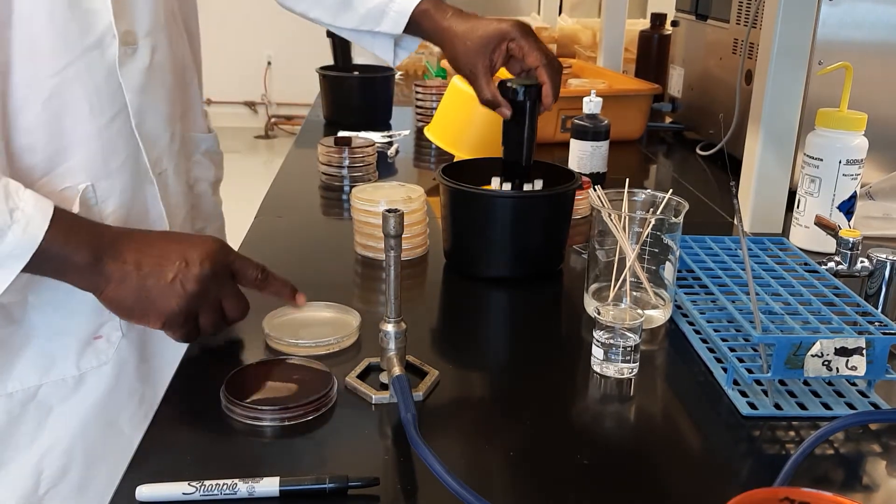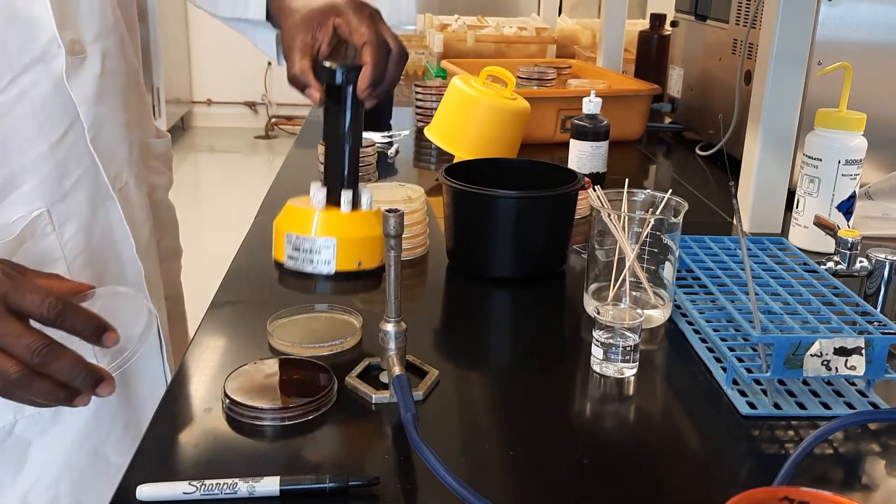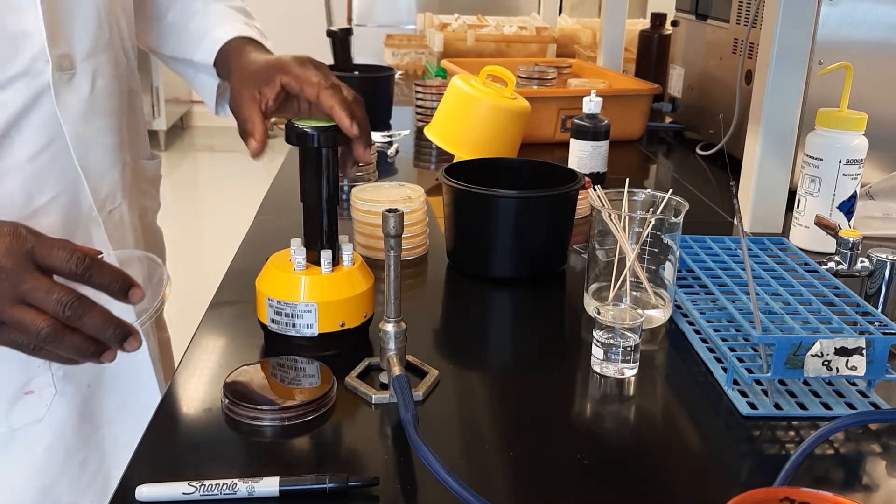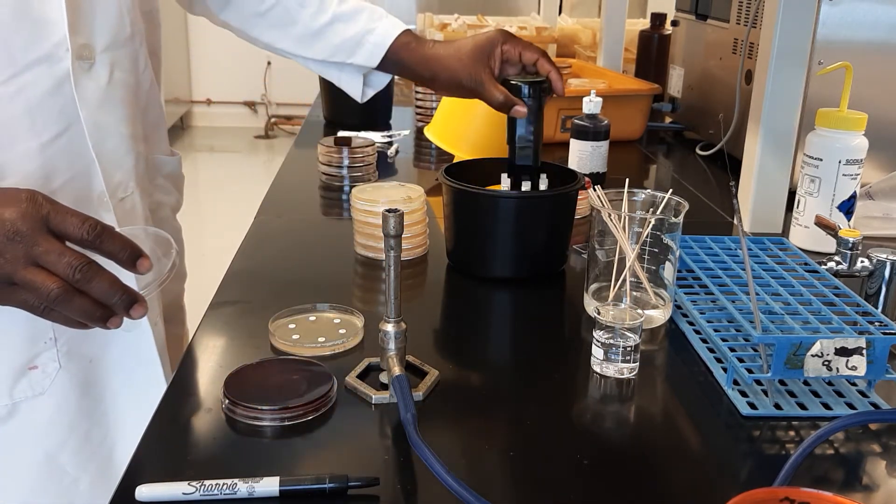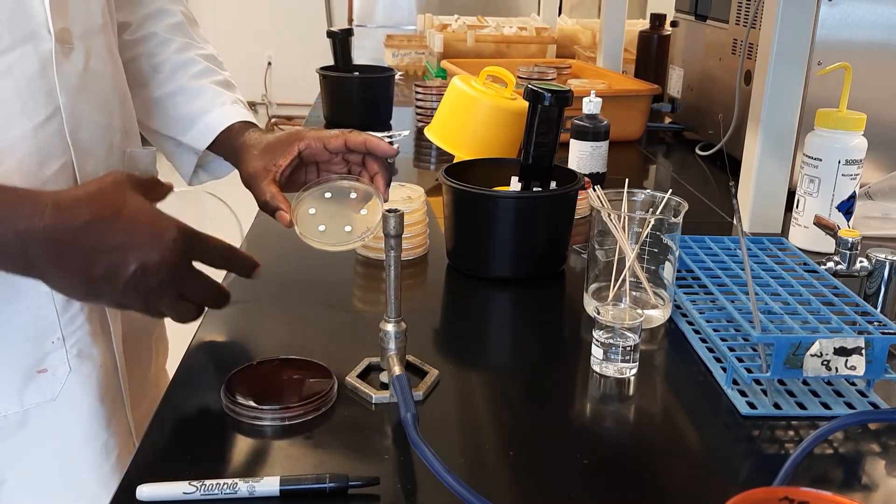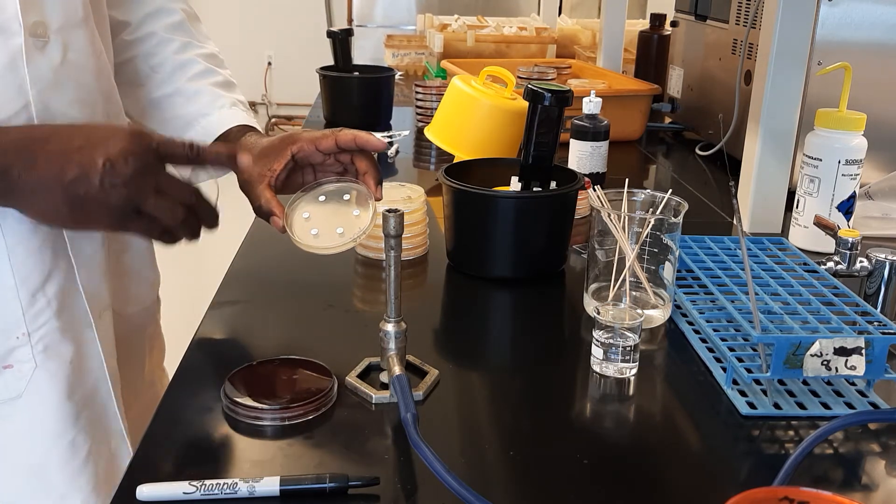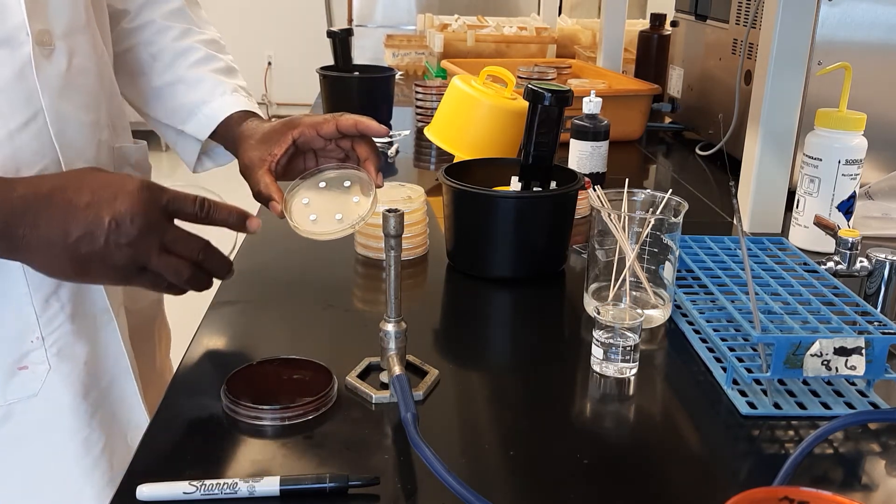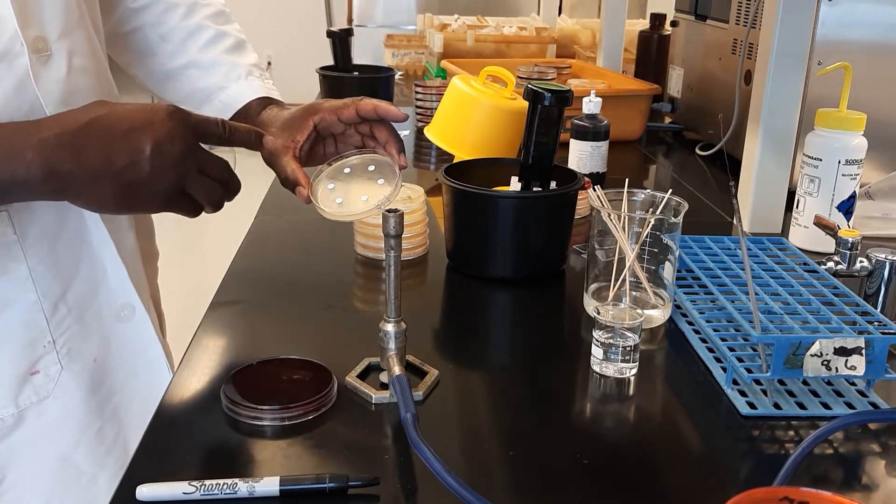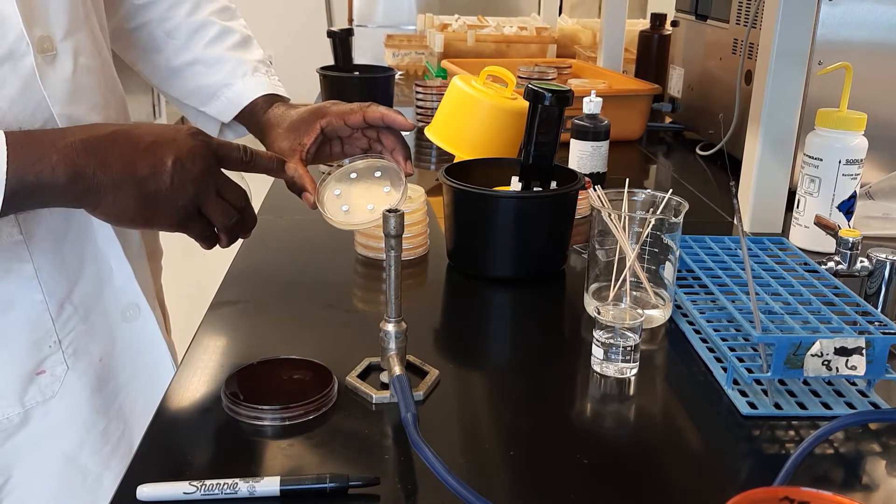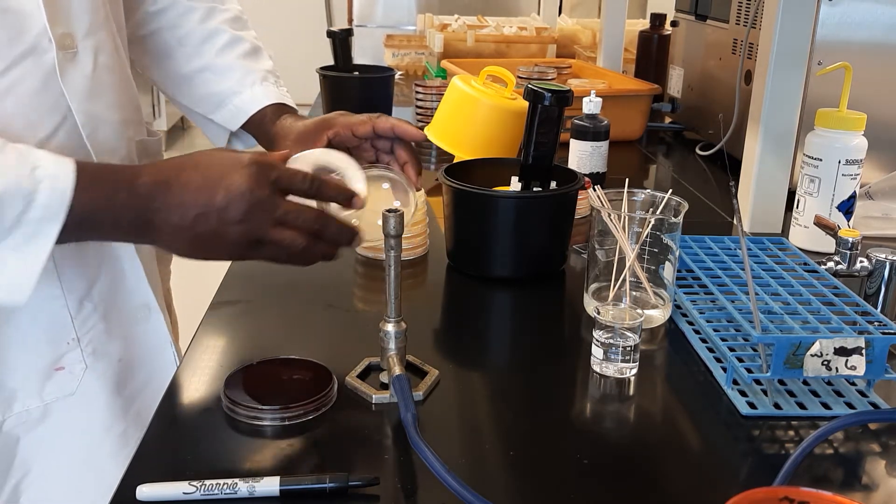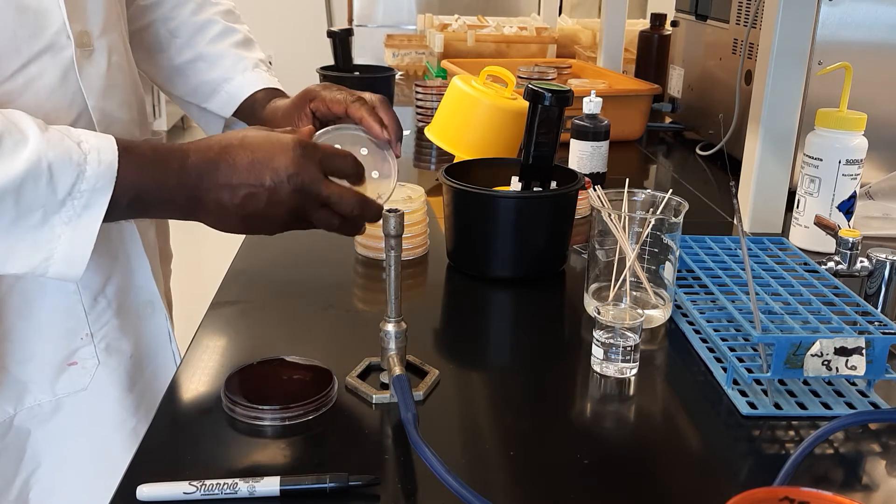And by doing that, we apply six different discs onto that particular plate. So instead of doing it individually, now it applies six at one time. So we can see we have vancomycin, tetracycline, gentamicin, erythromycin, penicillin, and chloramphenicol at different concentrations.